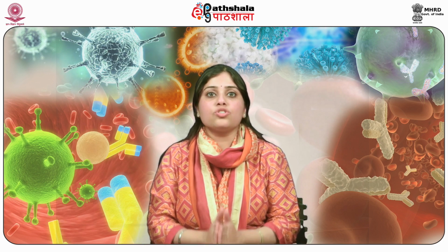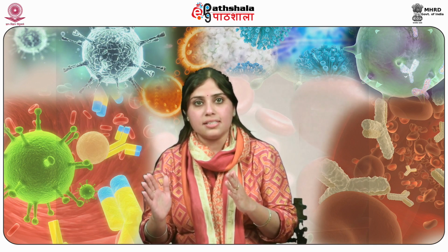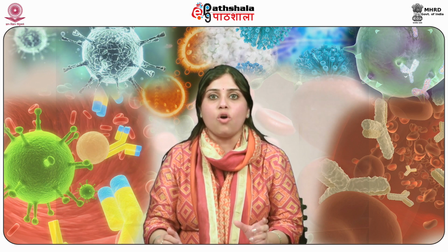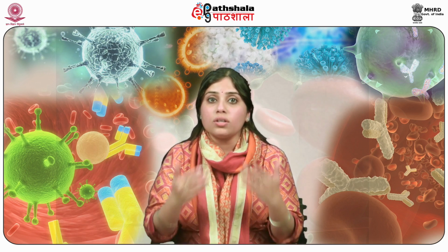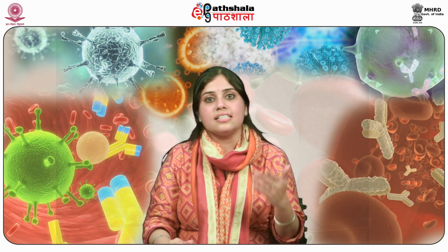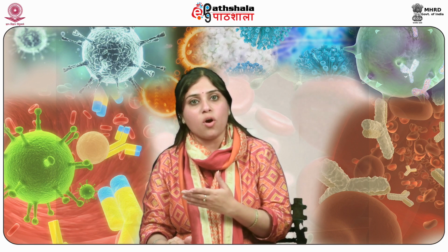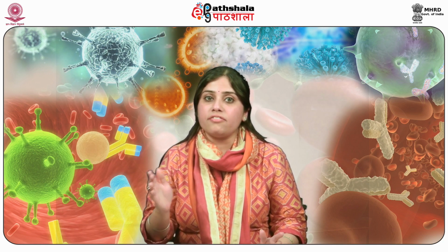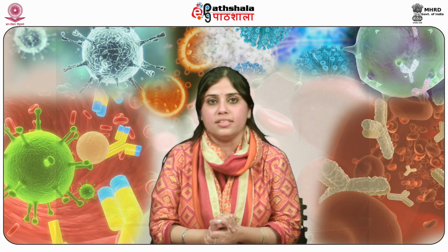The avidity amounts to the total strength by which an antigen binds to multiple antigenic determinants and multivalent antibodies. Avidity is affected by the valence of the antibody as well as that of the antigen and is therefore more than the sum of individual affinities. Hence, affinity is the strength of binding between a single antigenic determinant and its corresponding individual antibody combining site, whereas avidity refers to the overall strength of binding between multivalent antigens and antibodies.